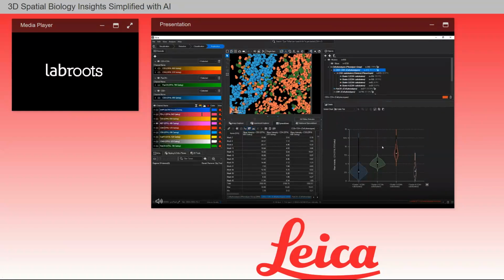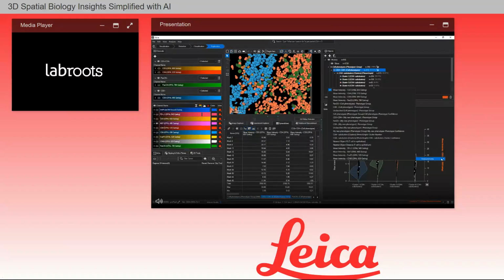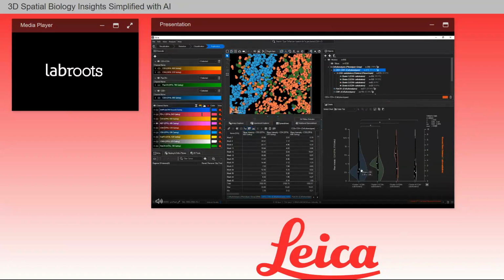I am going to right-click on the chart and select two-sided violin. This will give me a second violin plot where I can plot, for example, mean CD4 intensity with the nearest object distance. Now I have two distributions, CD4 intensity on the left, object distance on the right. We have other chart options that I will not be going over today.